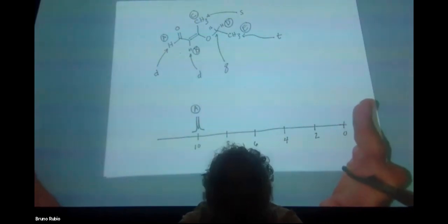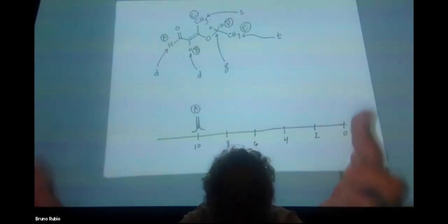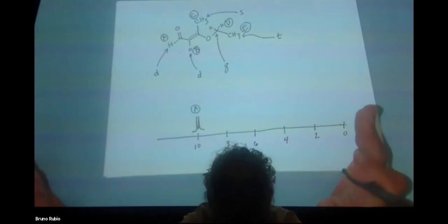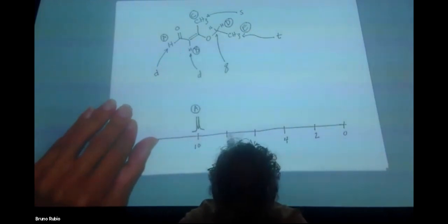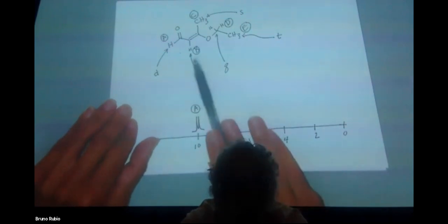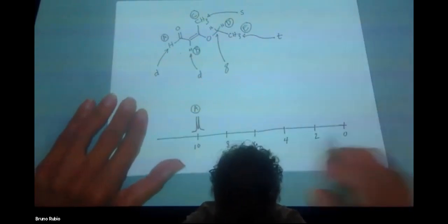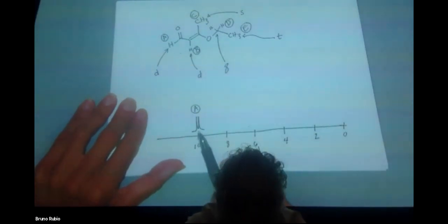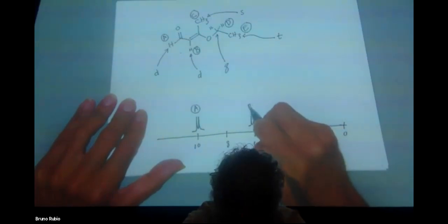I don't expect you to come up with the chemical shift with 2 decimal point accuracy, right? Just something that is reasonable and in that range, maybe plus or minus 1 ppm. I'm not looking for double-digit decimal point accuracy. So an alkene proton, because it's close to that multiple bond, is usually somewhere between 5 and 7. This one's pretty close to an electronegative atom. It's pretty close to another multiple bond. I'm going to put it at around 6, and it's going to be a doublet at about 6. And so, see, this was a 1 hydrogen signal. So this other doublet, when I sketch it out, I'm going to make it about the same size as the one I drew before, right? Okay, so now that's B.